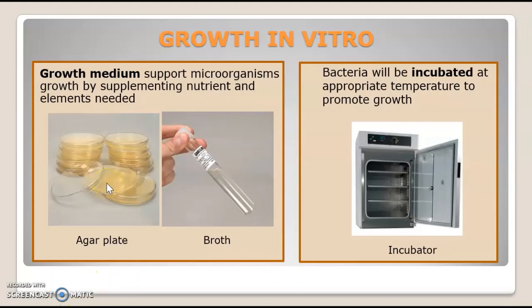After you have cultured your bacteria in either the agar plate or nutrient broth, you need to incubate in an incubator.